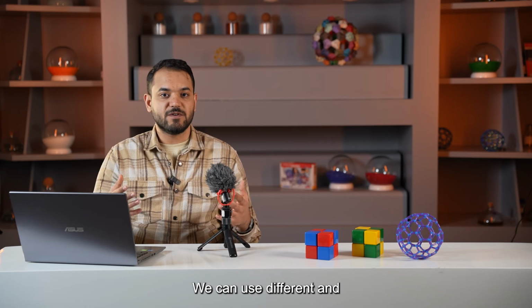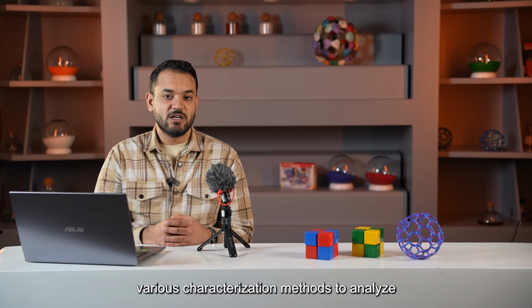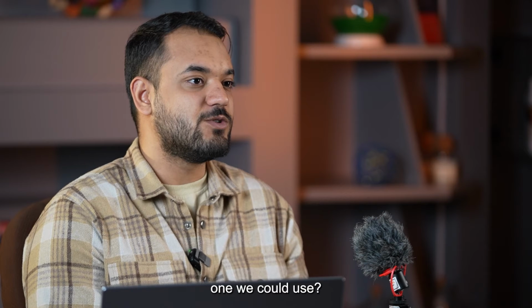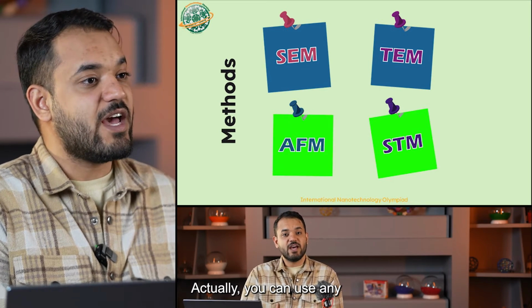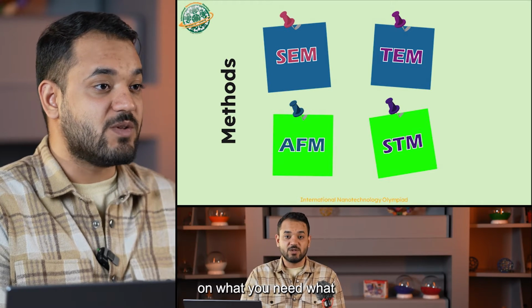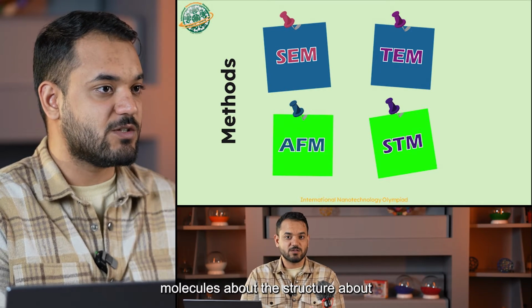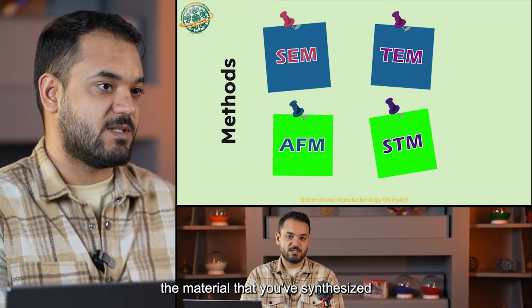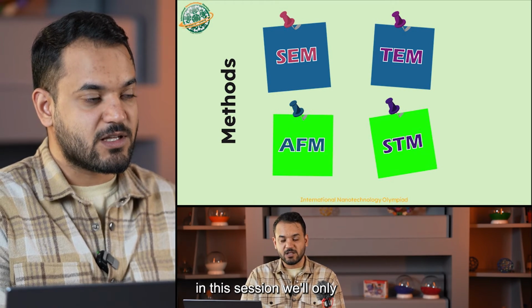We can use different and various characterization methods to analyze our product. There are different types of nanomaterial characterization methods, but which one could we use? Actually, you can use any of them, but it really depends on what data you need about your molecules, about the structure, about the material that you have synthesized. In this session, we'll only talk about microscopy methods.